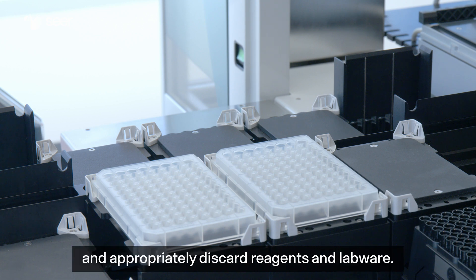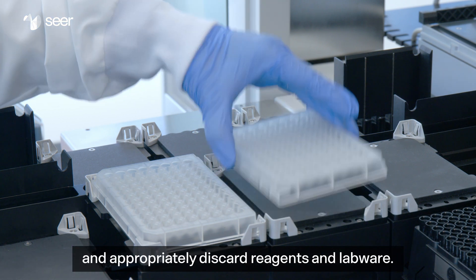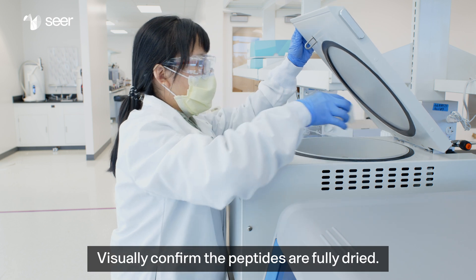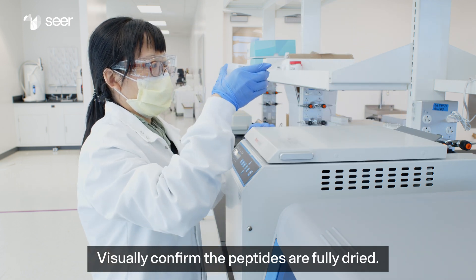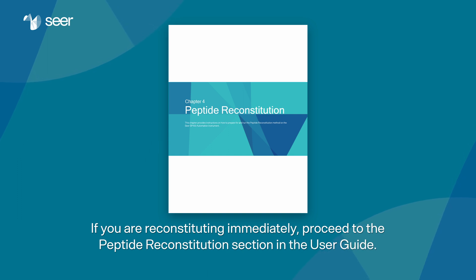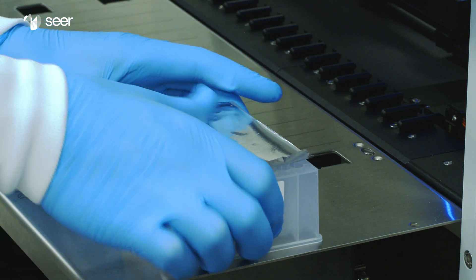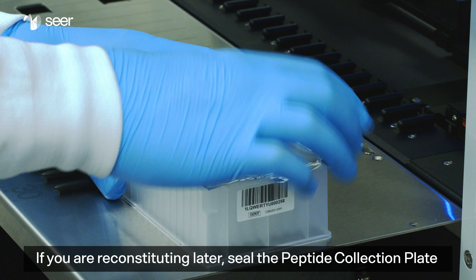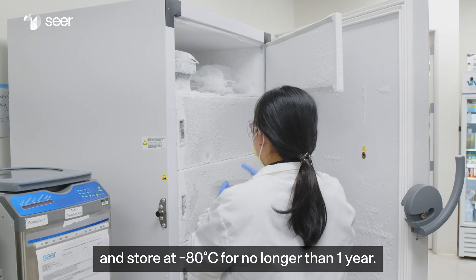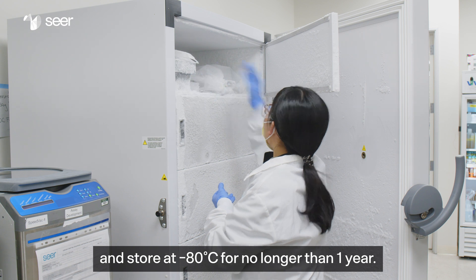Clean the work deck and properly discard reagents and labware. Visually confirm the peptides are fully dried. If you are reconstituting immediately, proceed to the peptide reconstitution section in the user guide. If you are reconstituting later, seal the peptide collection plate and store at minus 80 degrees Celsius for no longer than a year.